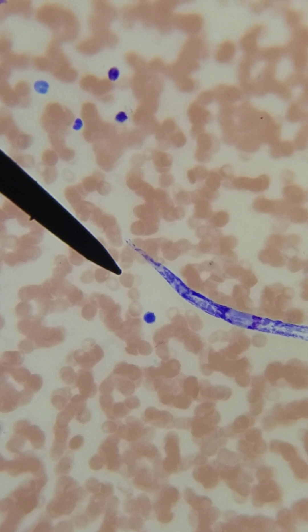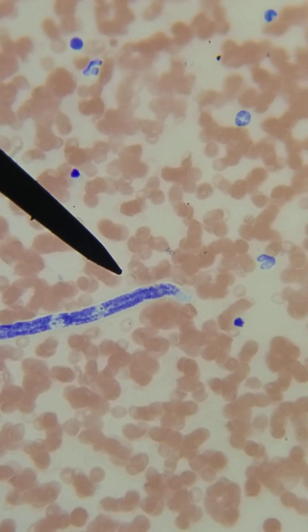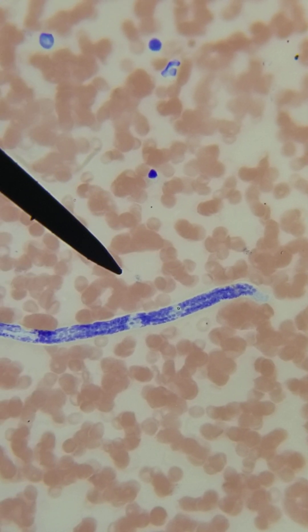Ours have two nuclei at the tip of the tail, and that absolutely indicates that we have Brugia malayi. Let's see — I'm just going to show you a tour of the whole one. It's gorgeous. Yes, we got it right. Wonderful job, everyone.